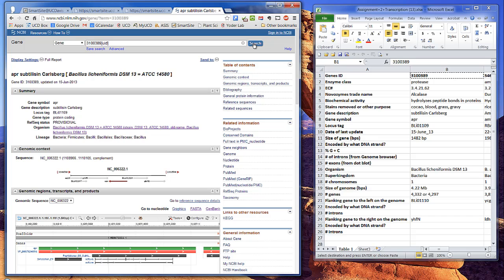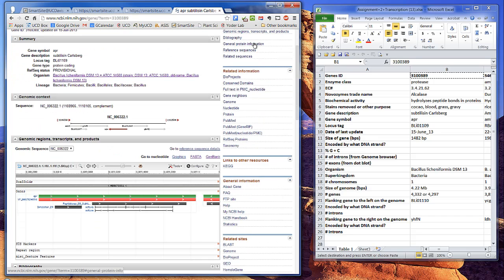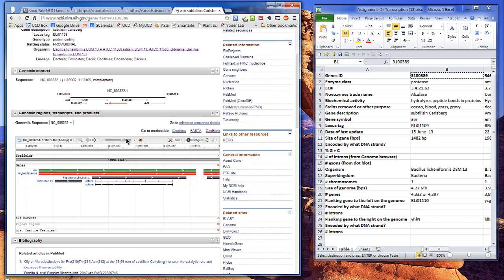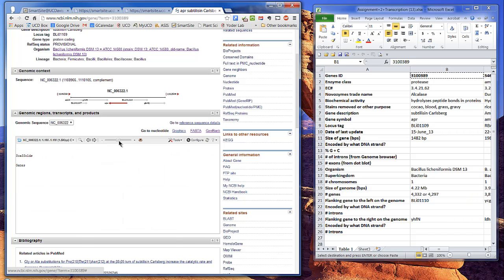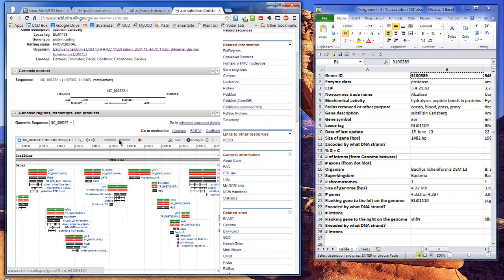The genomic context section shows the orientation of the gene we're looking at, as well as a few flanking genes. You can get this same information from the genome browser if you scroll out. The orientation arrows are related to which strand of DNA is transcribed. Assume the transcripts pointing towards the right are encoded by the Watson strand. Complete the rows in the table showing what strand encodes the rest of the genes. Now let's find some real sequences.